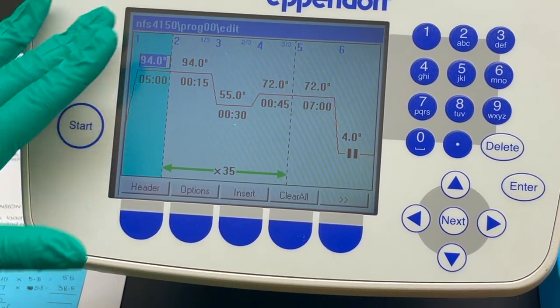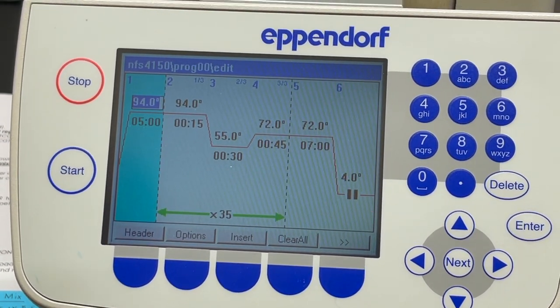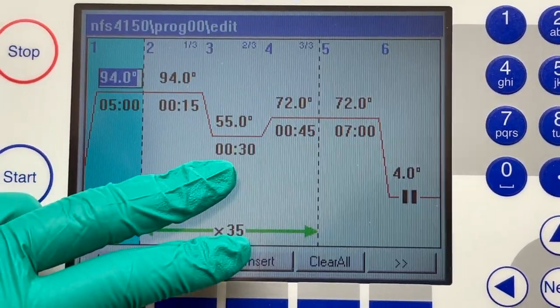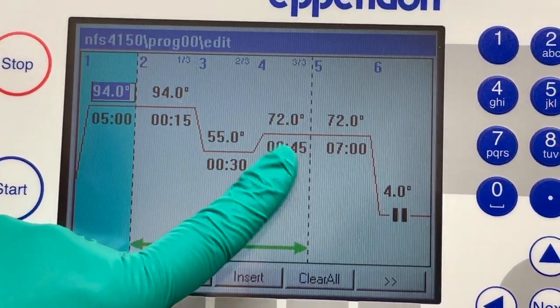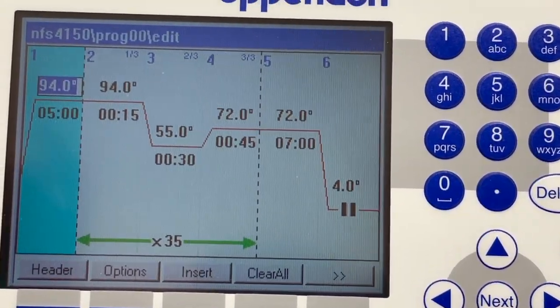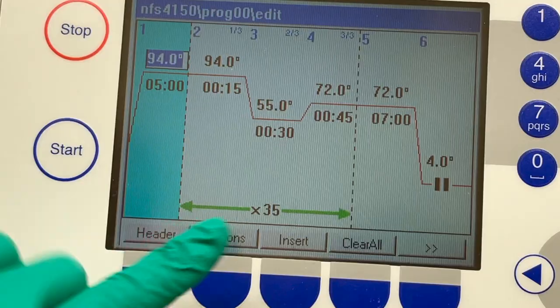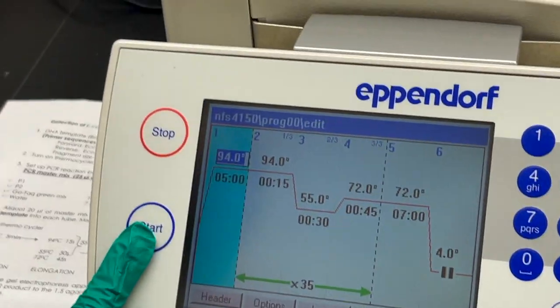The PCR parameters are set as follows: the initial denaturation is at 94°C for 5 minutes, which separates the double-stranded DNA. Next is the annealing step, where the forward and reverse primers bind to specific regions of the DNA — this runs for about 30 seconds. Then the extension step follows at a slightly higher temperature, where Taq polymerase synthesizes new DNA using the annealed primers as a starting point. There are 35 cycles in total, after which the machine holds at 4°C.